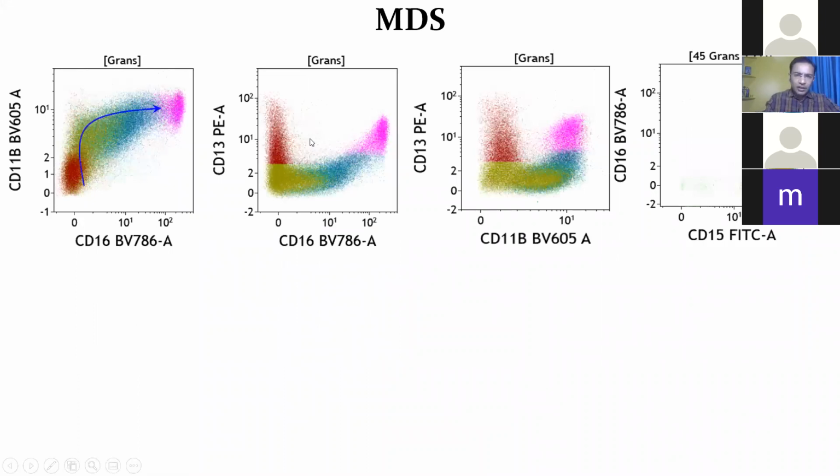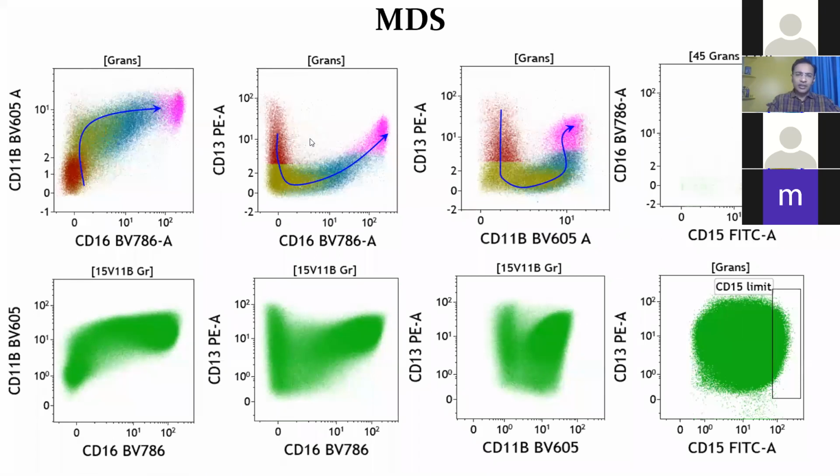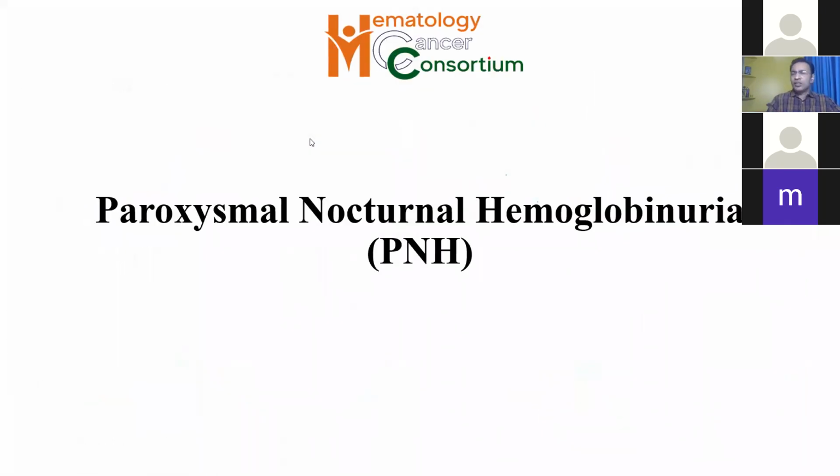I'll just skip because this is a little complex. Now PNH is something different, which you usually see. Up till now we have been looking at abnormal positive expression. In PNH it is abnormal negative expression.